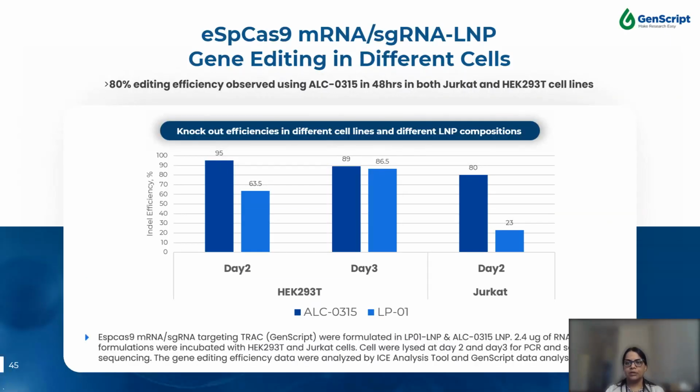Not only that, but we are also providing the mRNA in a nanoparticle formulation. Here the study was carried out with two different LNP formulations generated: one is ALC0315 and the other LP01. 2.4 microgram of each LNP formulation was incubated with HEK cells and Jurkat cells.